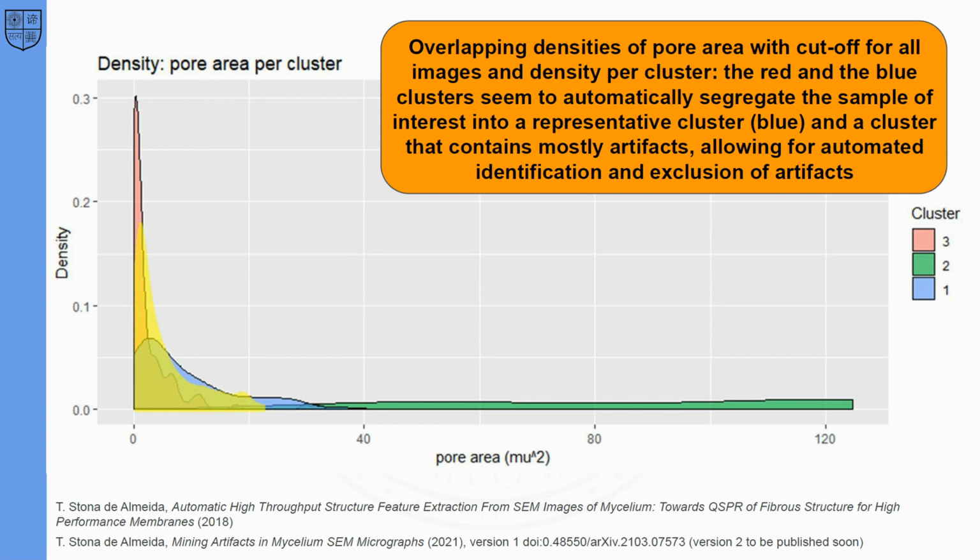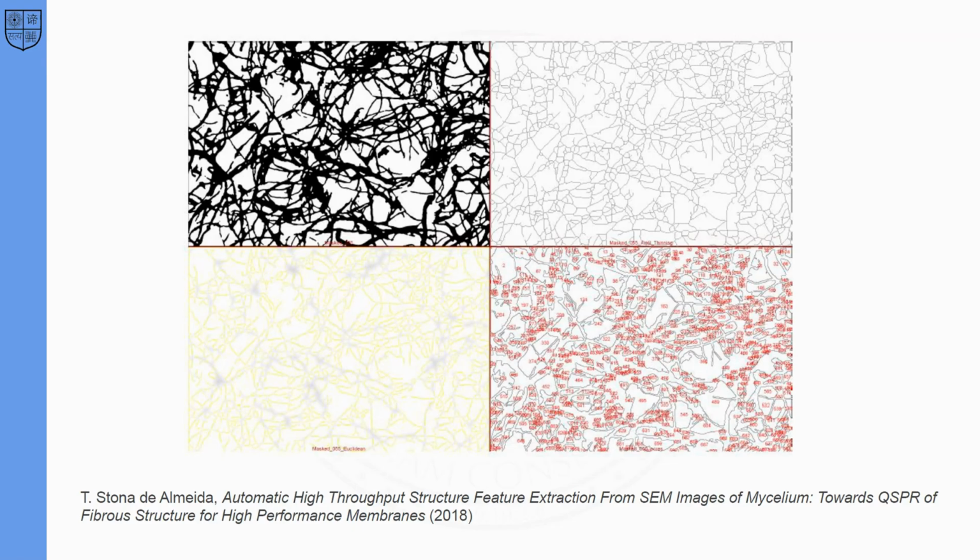The researcher's choice of cutoff helps eliminate artifacts and removes the skewness of the data, which could be explained by pore detection too close to the limit of the resolution capabilities of the software. But the additional application of k-means on the feature space confirms the cutoff and enhances the identification of artifact pores. This is a result valid for this given set of Ganoderma resinaceum micrographs at 3000 times magnification and good quality of coating for obtaining great quality SEM micrographs.